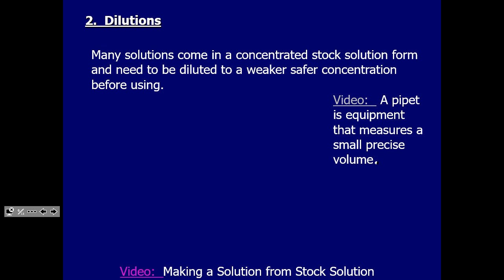Okay. Let's now talk about the calculation. I am going to take a small volume of the concentrated solution. There it is. It's a small volume. It has a particular concentration of C1, the beginning concentration.